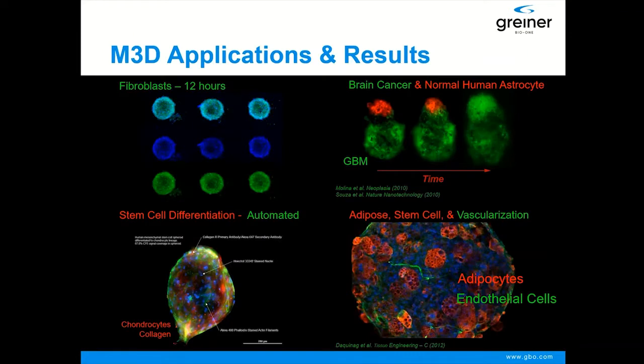So this is just a quick tour of some of our results. Because we use a magnetic field, and I'll get into detail, you can bring the cells together and form the 3D structure very fast.